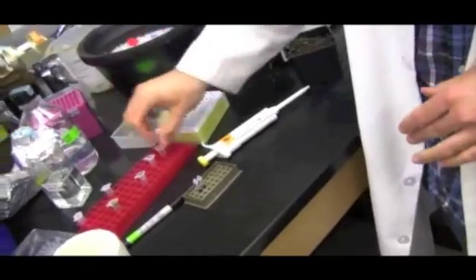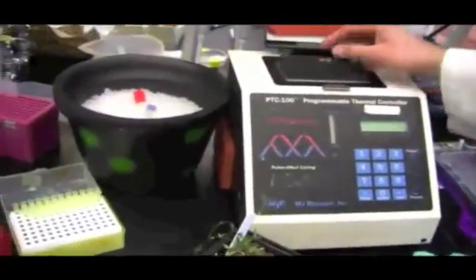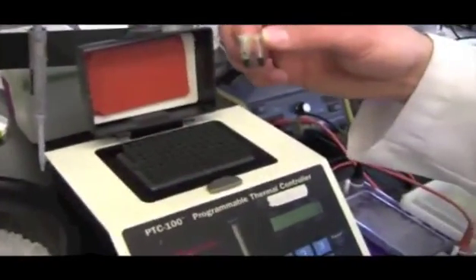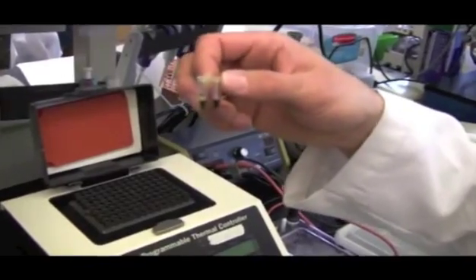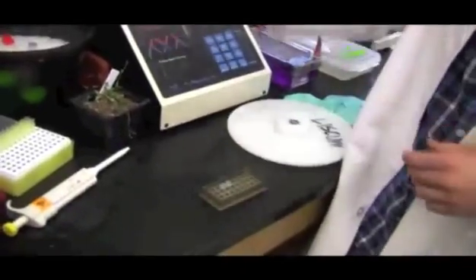Cool. So now we're all ready to go to make a bunch of copies. So we put this mixture in what we call a thermocycler. This is a machine that changes different temperatures so that it tells that protein inside, or if we're using our analogy again, our copy machine, when to turn on, when to turn off, and basically tells it when to make all our different copies. And so this is one that I did earlier today. So hopefully if our reaction worked, we're going to have a bunch of copies of just our DNA that tells us how to make that one protein. So the one gene out of the 20,000 that's in there. So I'll put this in for later.